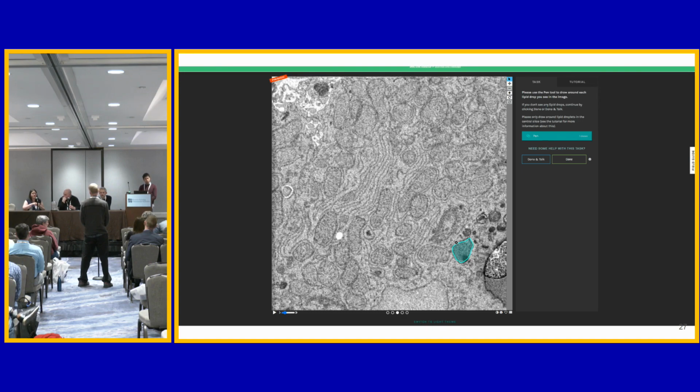So I can say in our image analysis facility, it very much depends on the collaborators. If we're paying for it off of our own grants, it comes in with the understanding that the model is now going to be public the second you have your data published. For some of our commercial collaborations, we obviously can't do that. But I think the more and more that we can do that, and even if you don't have the model, open sourcing the data so that then somebody else can make the model is sort of step one.